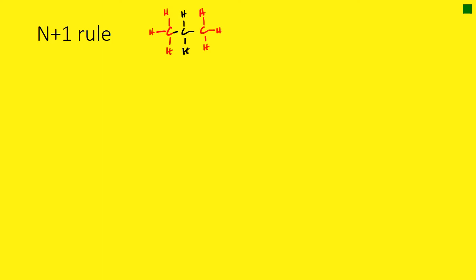So let's see what we get. Our spectrum might look like this. Hopefully I can draw it nicely. So we've got our chemical shift, let's say 0, 1, 2, 3, something like that. Our CH3 groups have 6 hydrogens, and CH3 groups are going to have a chemical shift just less than 1. And that pattern is going to be split. Let's switch to red.